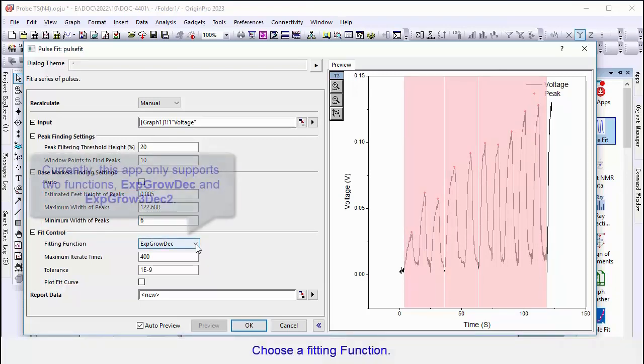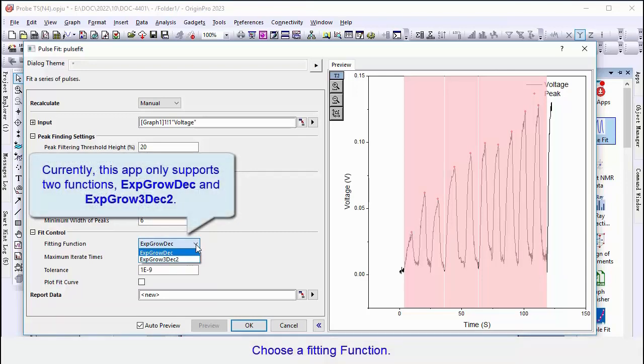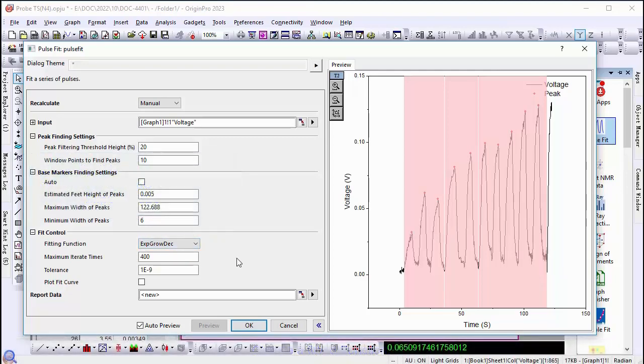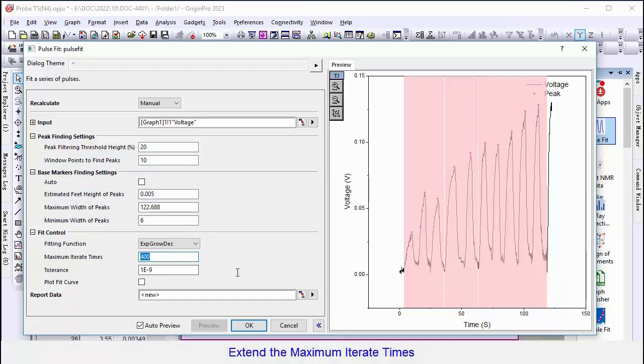Here, choose one of two functions: Exponential Growth Decay and Exponential Growth 3 Phase Decay 2 Phase. Increase the maximum iterate times and tolerance if needed.